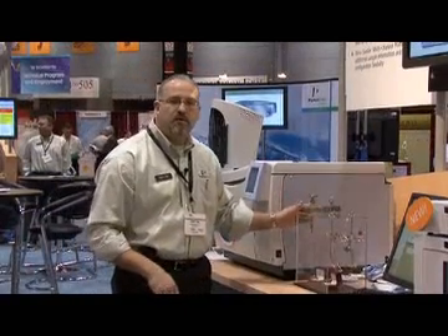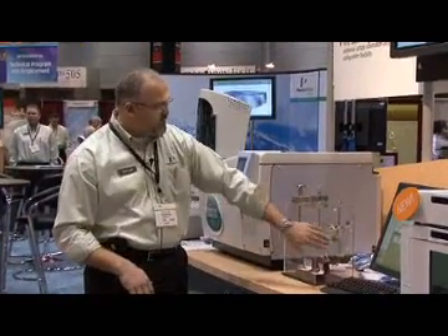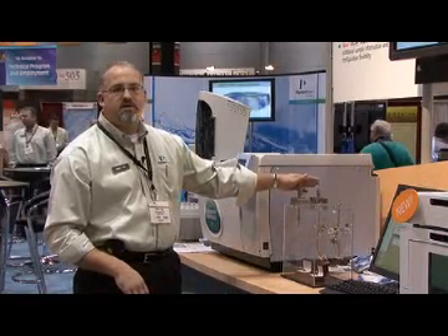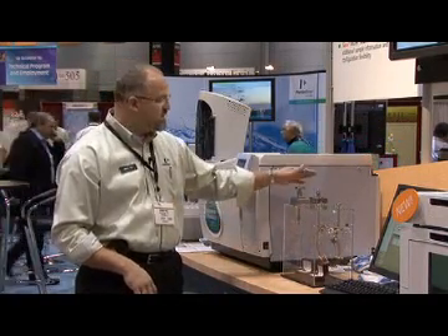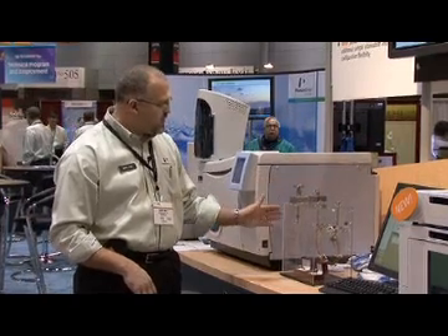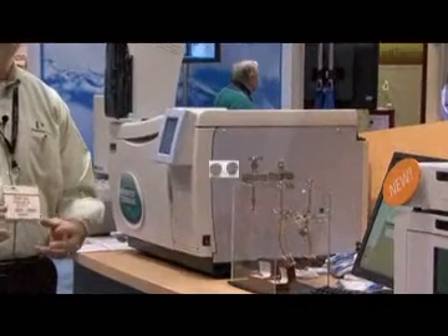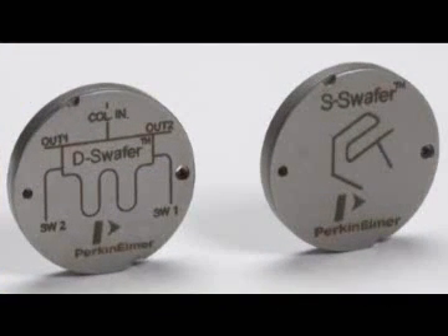This is an example of a D-Swafer. It will mount on the inside of the oven. In this particular configuration, we have two injectors — one headspace, one liquid — but we're going into one column. So the customer doesn't have to go in and change columns when they want to change sample introduction technique.